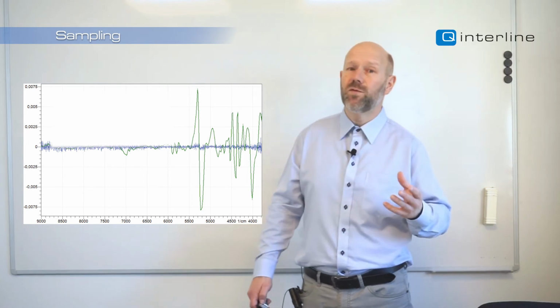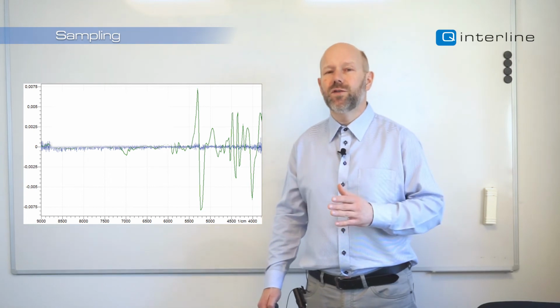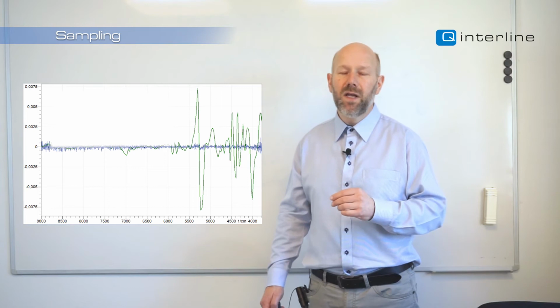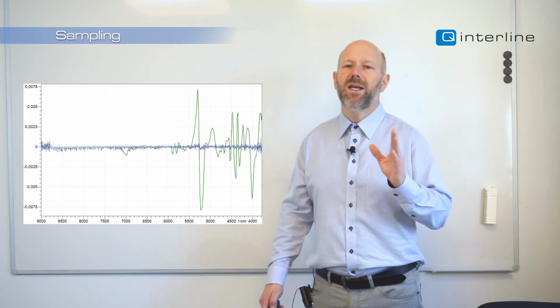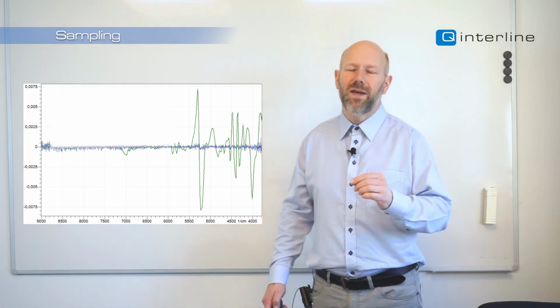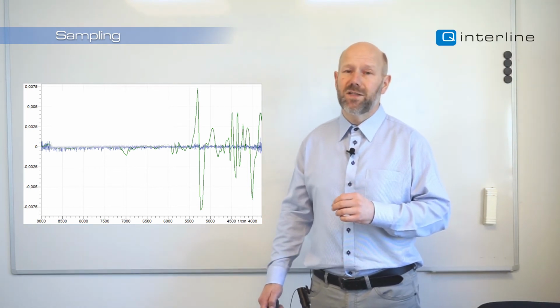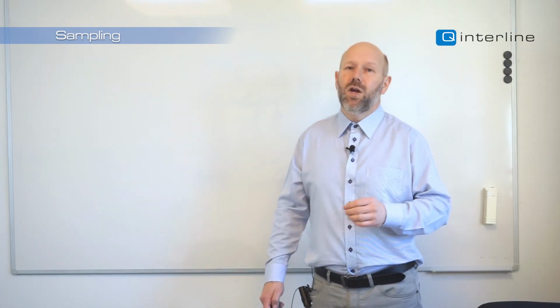If we want to work with 4, we would have to scan for a longer time or do other tricks. This is typically something not seen when we build the model, and we would add a lot of smoothing to the blue spectrum in order to get back to the green, and then what's the point? So be careful with resolution. It's not necessarily the easy thing to come around. Then it comes down to observation time.